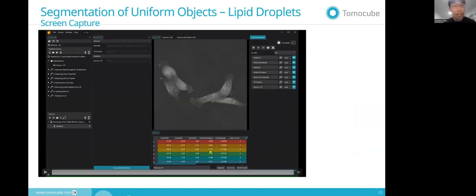So here you see that on the left side, it's the pipelines for the analysis of LDs. And on the right side, you can see the outputs in the middle. So the outputs produced by each process are listed here like this. So in total, including the source or the original data files, there are in total 7 data outputs that are used for the analysis.